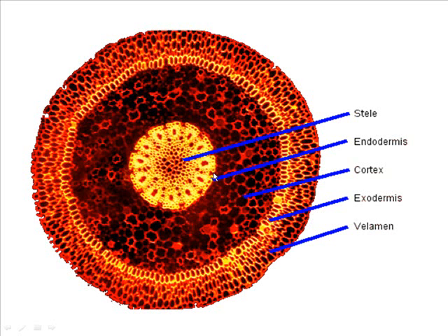Now then we have around this region here the familiar what? Endodermis. And although it's not labeled, what is the layer of cells, one cell thick layer just inside the endodermis, the what? The pericycle. And then the term stele, that's kind of a generic term for a central cylinder.